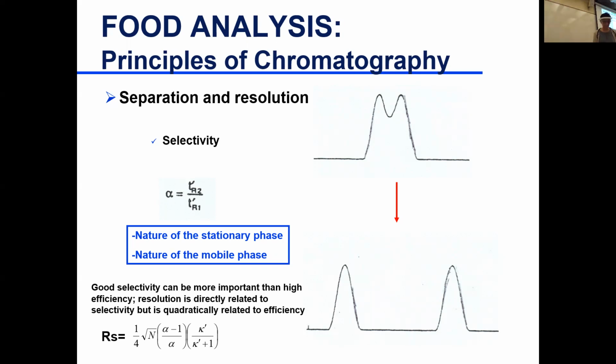I think I gave this example before. Let's say you have that question in the lab report for the HPLC. So if you have a reverse phase chromatography and you're using acetonitrile, it is a very strong solvent.